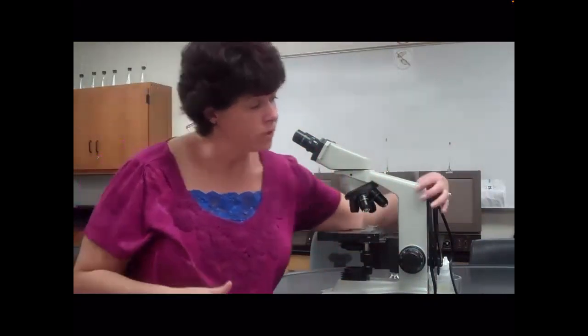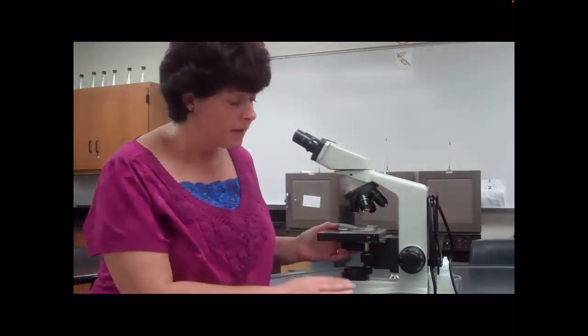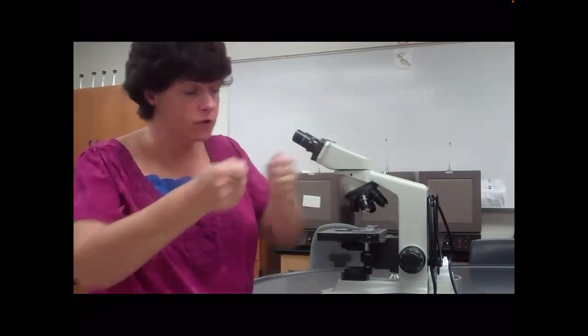You're going to put the cover on it, and remember when you take it back to the microscope cabinet, you carry with both hands. One hand will be holding the arm, the other hand will be underneath the base. Keep in mind the base gets really hot because of the light. So when you put your hand under there, it's going to be hot, but you still have to hold the microscope, okay?